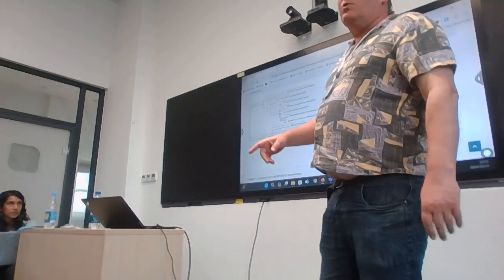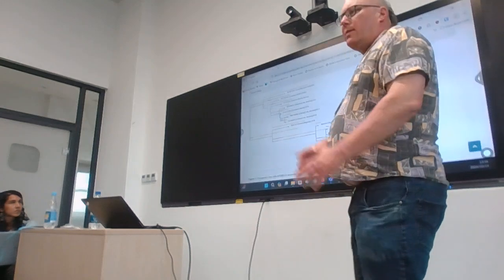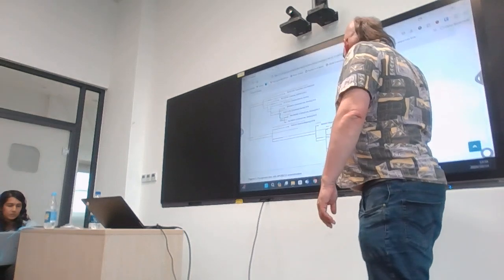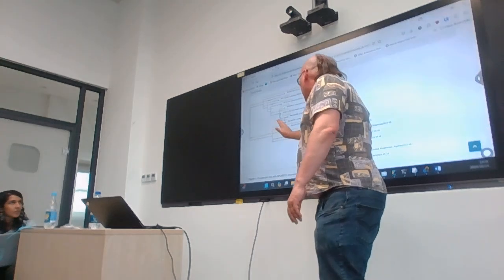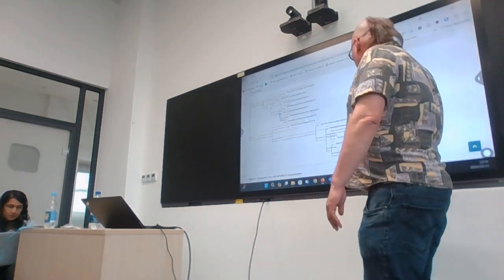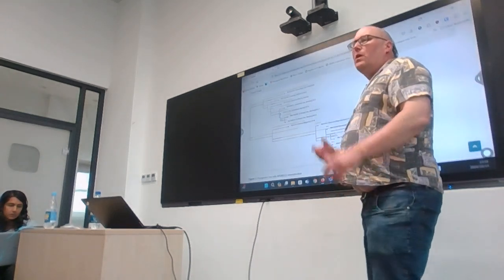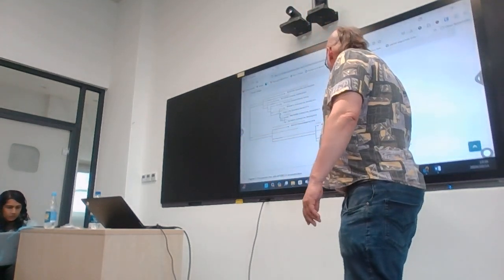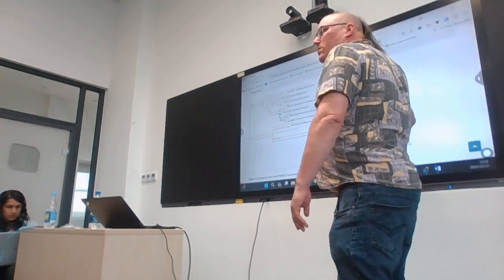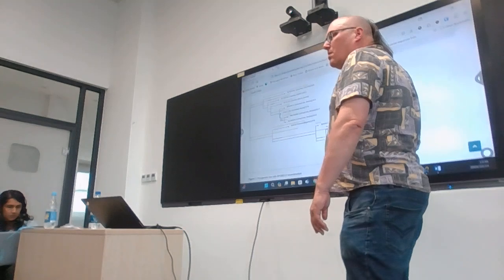The other thing I want to point out, this is a 2022 sample. Our sample was collected, I think, 2023. And we see another 2022, 2018. You see how time is moving basically in this direction, right? Which means that we can look at the length of the branch here to give us some idea as to the sequence quality. Because if suddenly it's collected 2023 but it's very long, over here, we'll discuss more when we do phylogenetics.